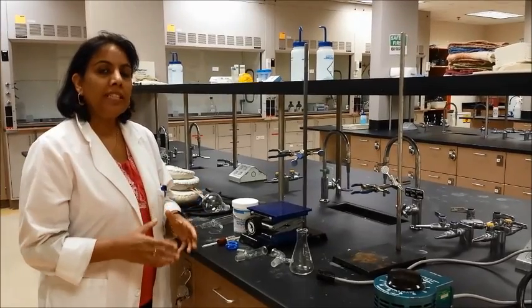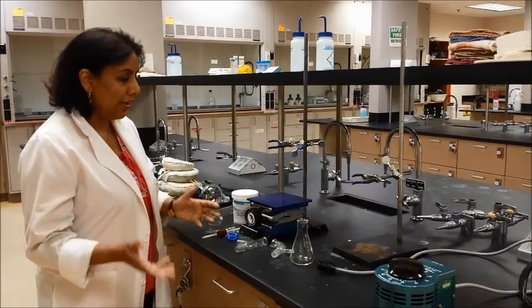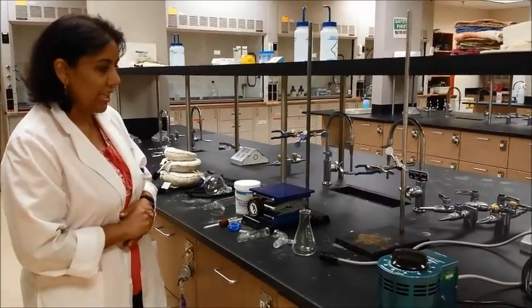I'm going to show you how to set up for a simple distillation. You need a lot of equipment to set up for a simple distillation.